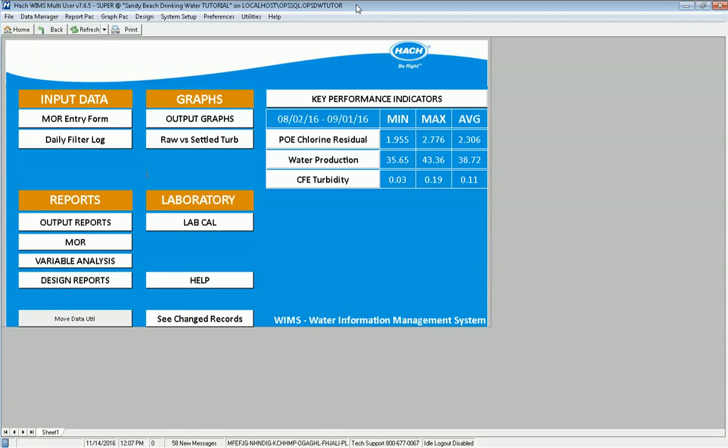In this video, I'll be covering how to handle minutely variables in a custom data entry form. Let's say you have a situation where you have to track the combined filter effluent pH and chlorine residual, and if the pH is not within a certain range, they want you to pretty much immediately resample it to verify it, but we want to track these data points.